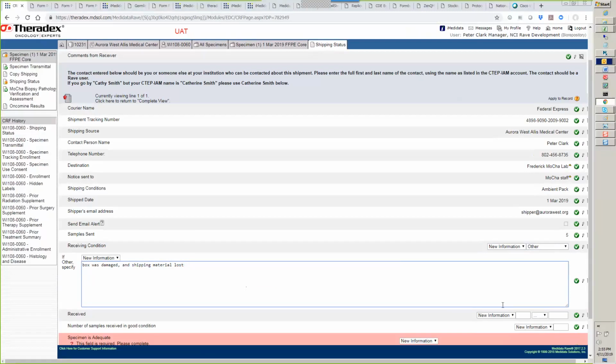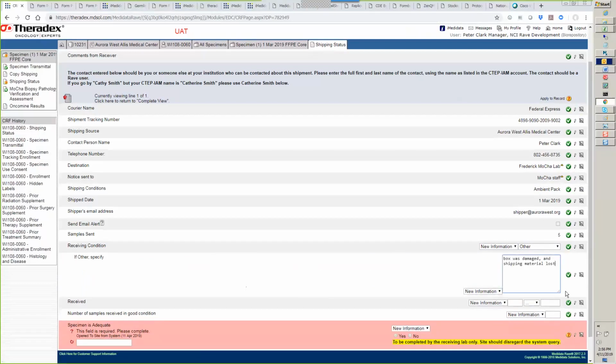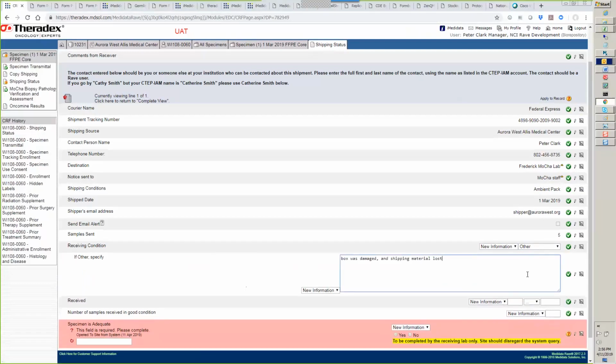So in Chrome, whenever you see this little handle at the bottom of a text box, that just means that you can change the size of it to whatever you need. It doesn't always work in other browsers, but we like to emphasize that Chrome works well with this.